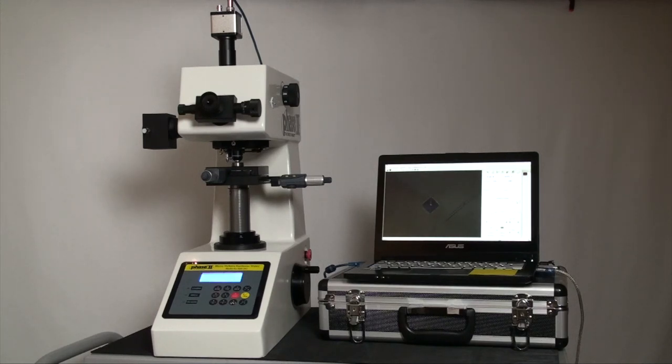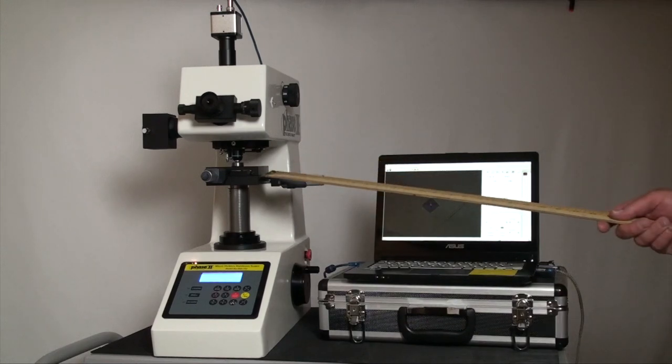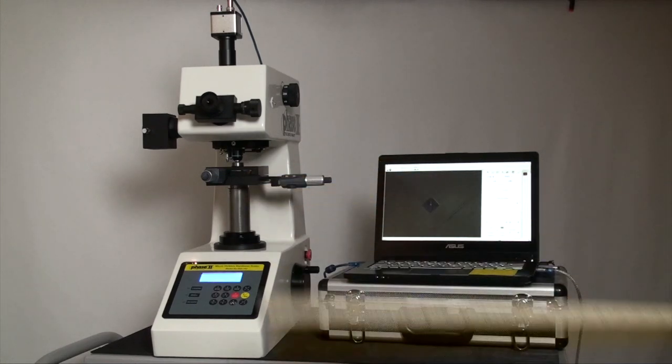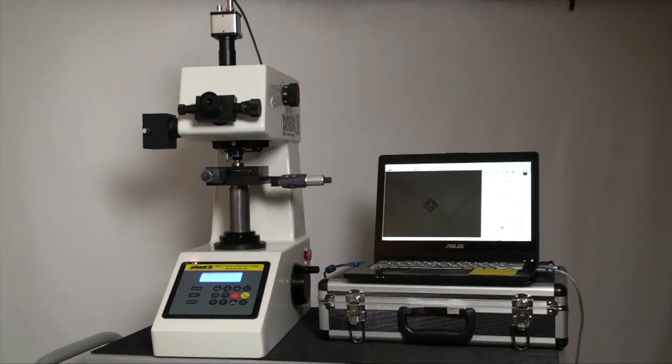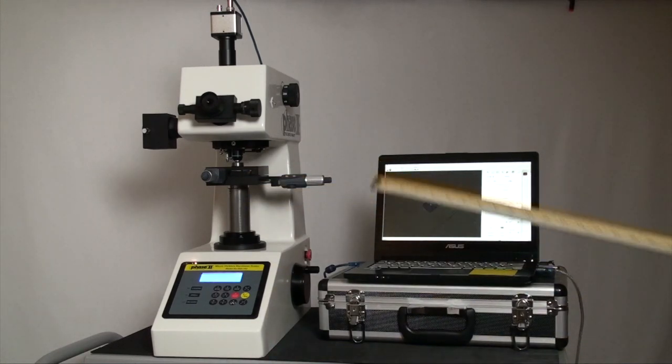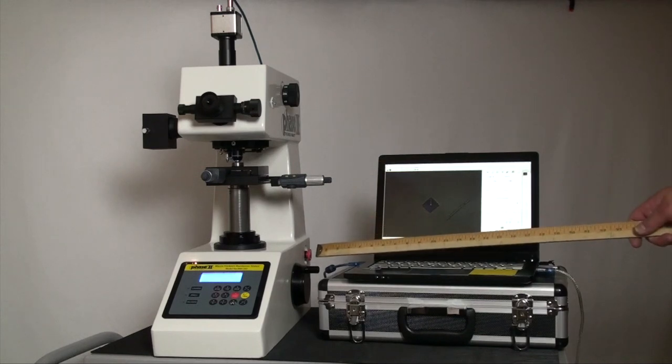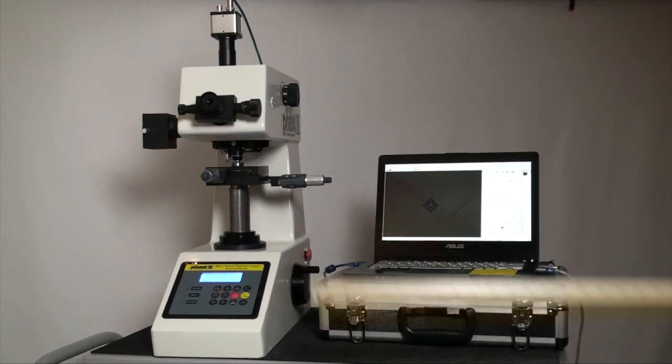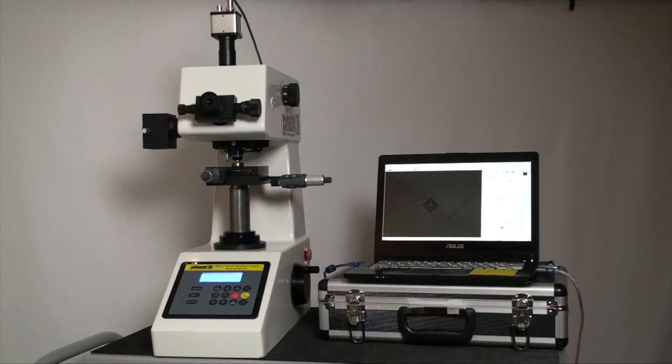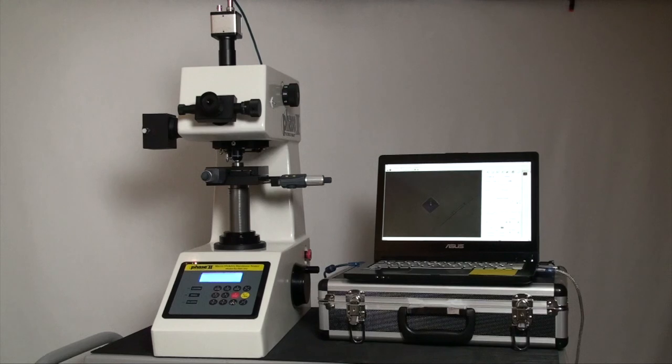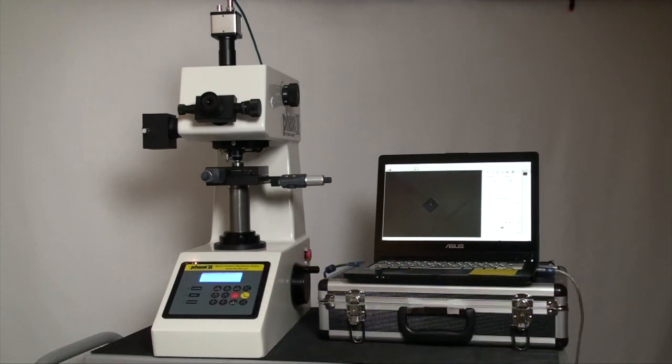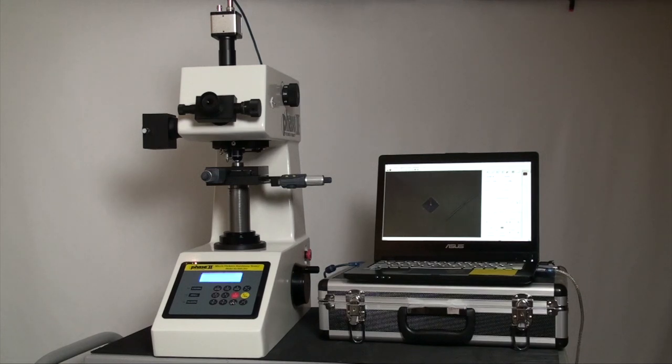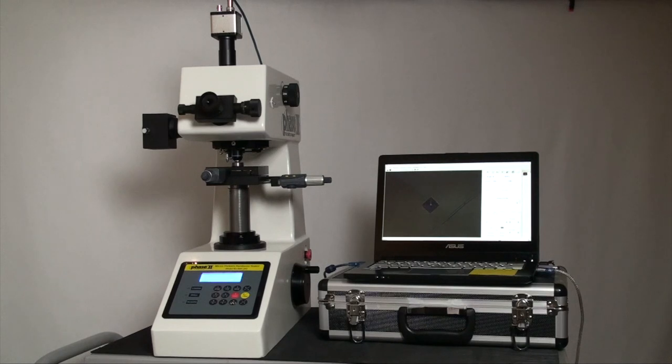Here is the XY stage with digital micrometers, a z-axis manual height and focus control, and the control keypad used for A, B and C version software systems. When using the D version as we have here, the software is in complete control of the testing procedure. No keypad is necessary.